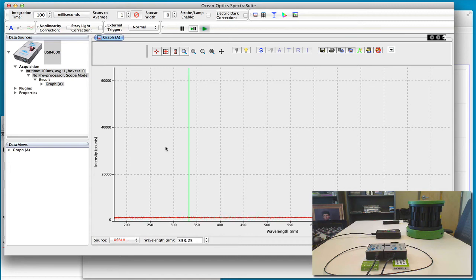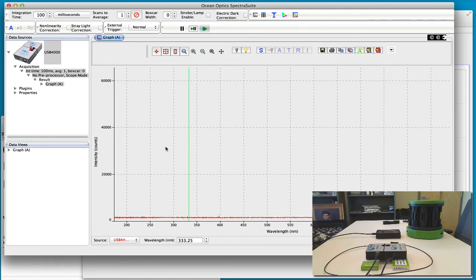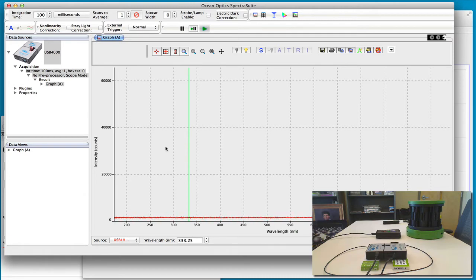Hello and welcome to another edition of PECAM Lab Screencast. I'm Professor Jeff Yager and I'd like to show you today a simple setup we use with simple spectrometers that are typically meant for one centimeter cuvette UV-Vis stuff that we can use to look at the gas emission spectra of in this case hydrogen, but you can do it for any typical gas emission.